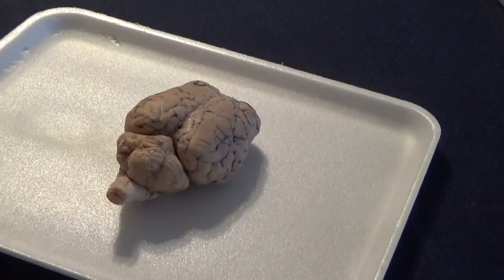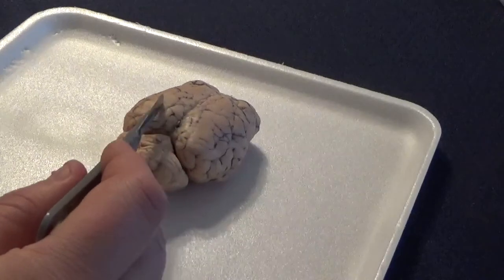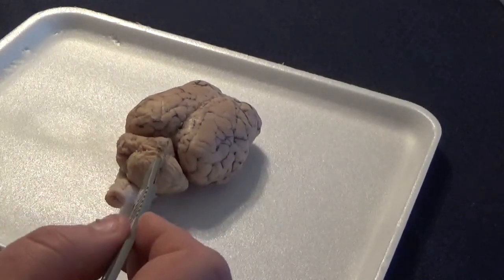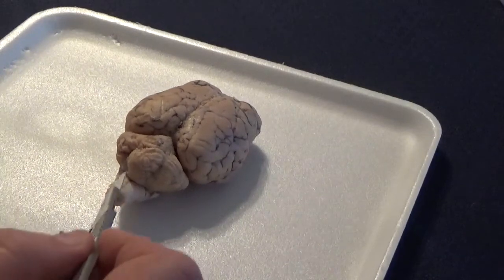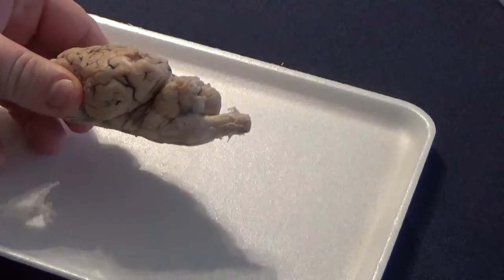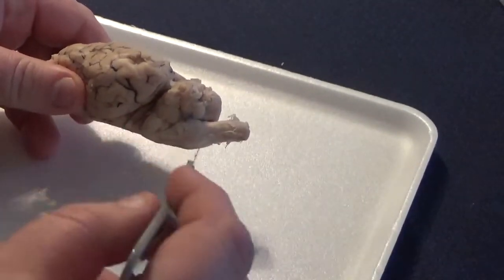So with the sheep brain, we can immediately notice some features. On the top, we have the cerebrum. Below that, we have this circular or spherical area called the cerebellum. And beneath that, we have the brainstem. Now, a sheep, if you can imagine, their brain's going to sit like this. So their spinal cord's going to cut out along the same plane as the rest of the brain.